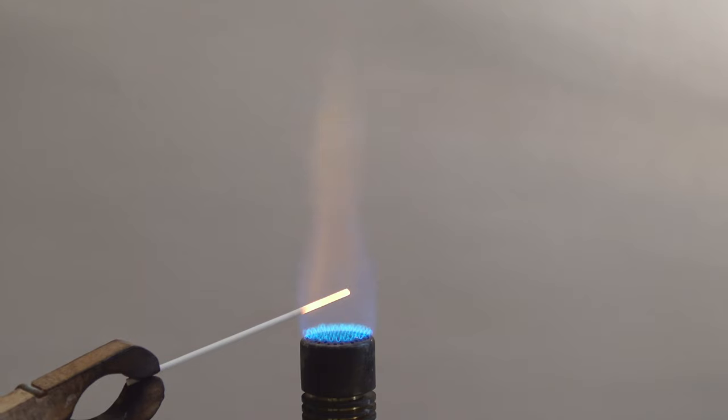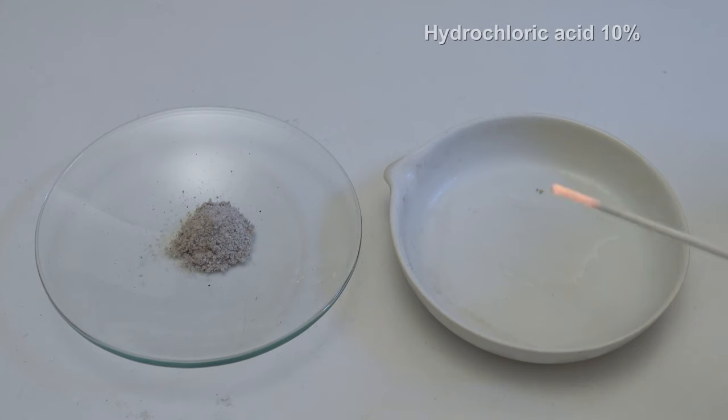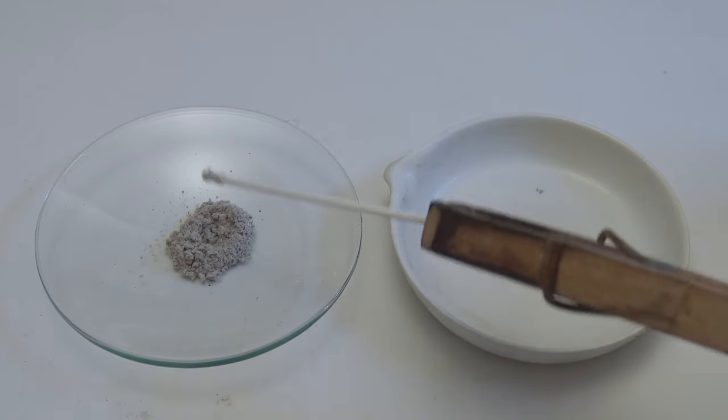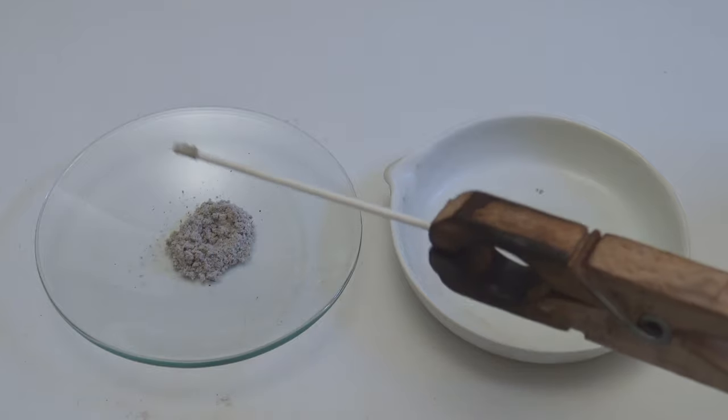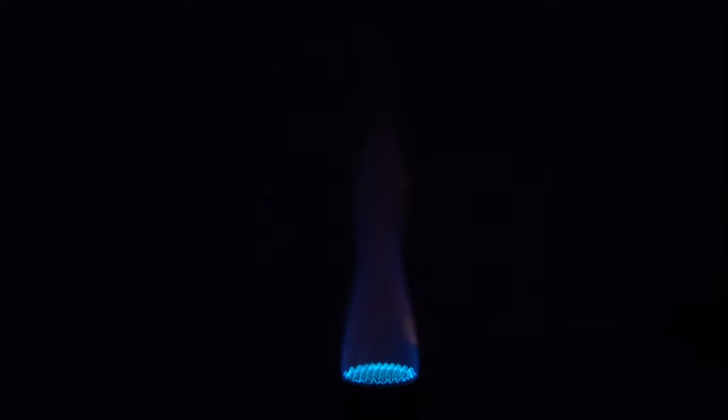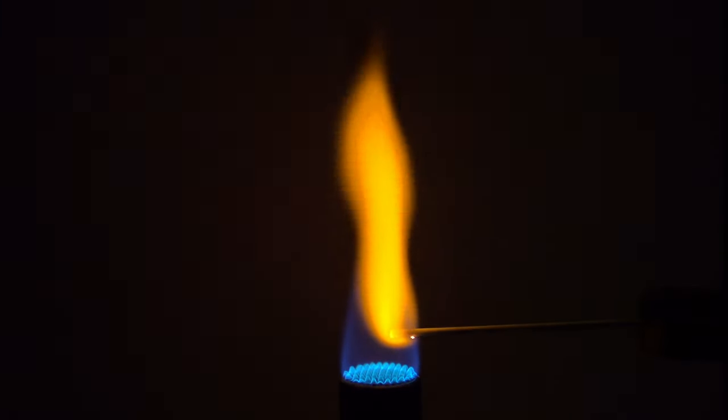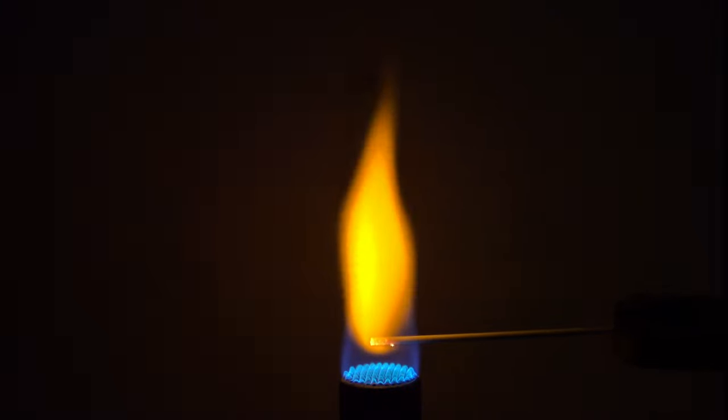Next, the stick is dipped into 10% hydrochloric acid and then into the sample. It is then held into the flame of the Bunsen burner.